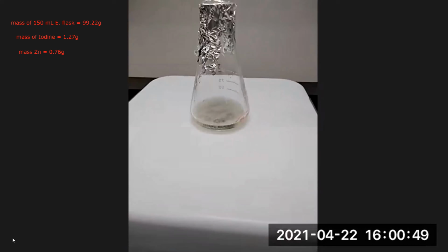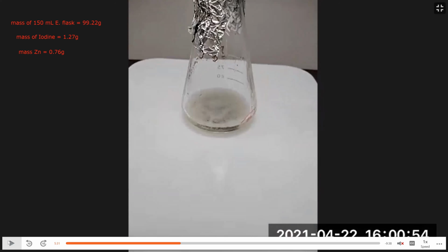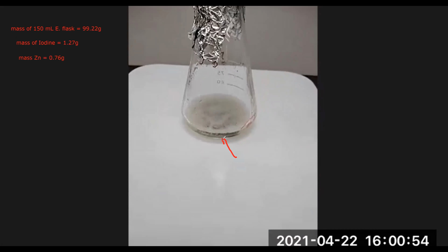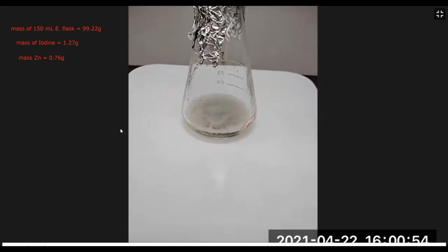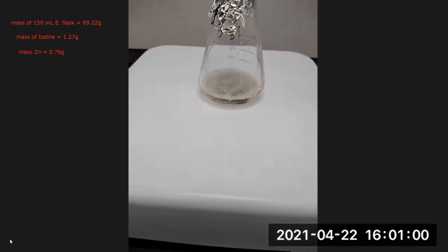So now we get to this point, it's colorless. If I make a note here, you can see the unreacted zinc that's still at the bottom of the flask. And that's okay, because we're going to have some unreacted zinc left over. So now we want to pour this into a beaker, evaporate out the methanol, and get our product.